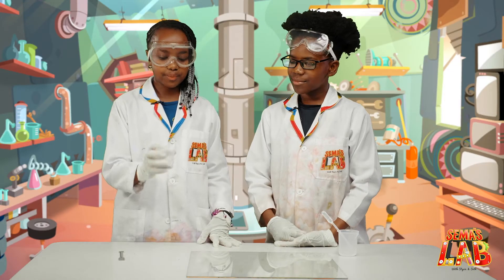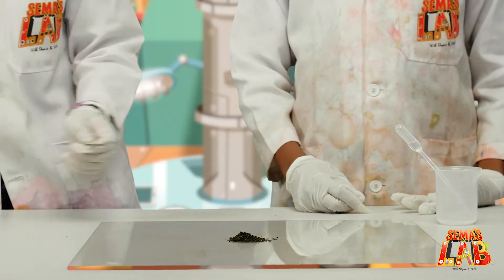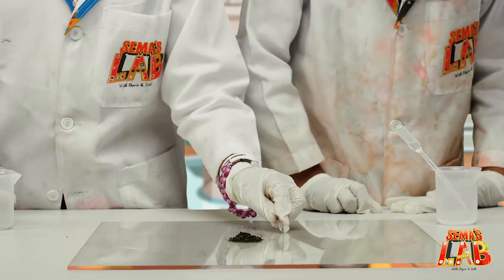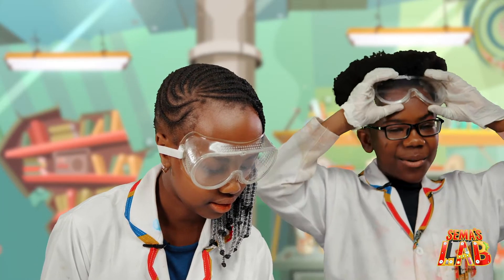First, you're going to pour the potassium permanganate into the middle. Then we're going to use the spatula to make it like a circle. Then we need our goggles on for this one now.